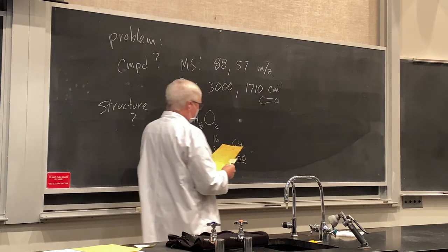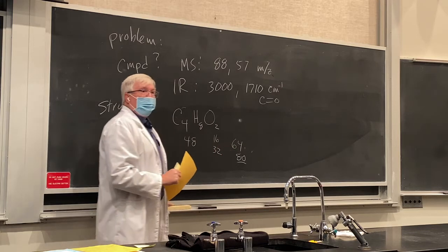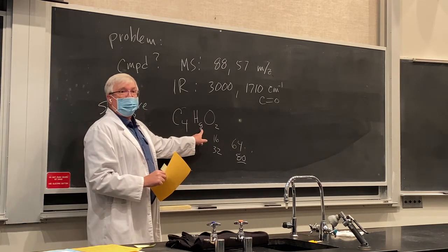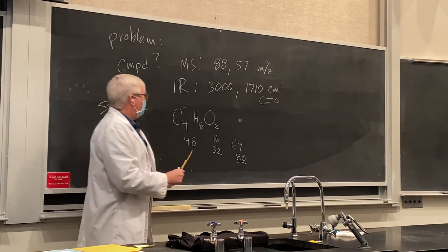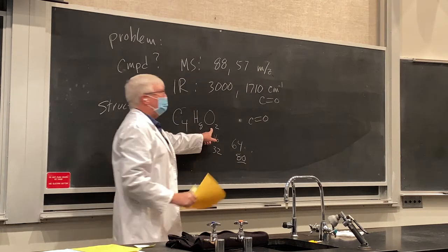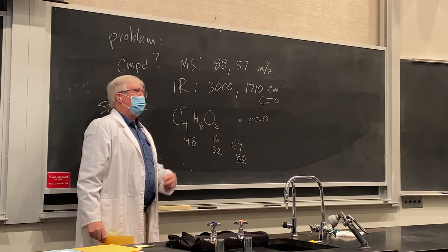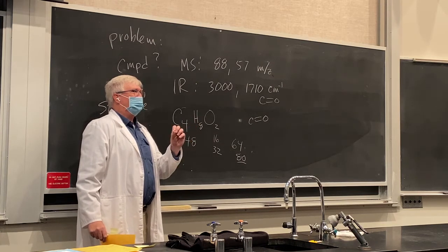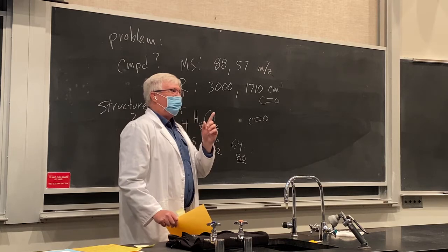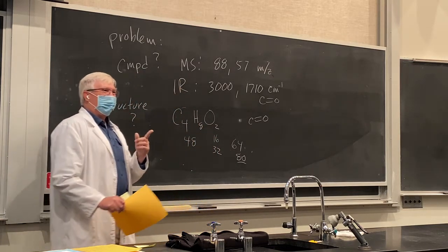Well, how many units of unsaturation do we have here? Well, that's our carbonyl, right? We have 1 unit. The max would be 10. So we've got 2 less hydrogens. So we got a carbonyl, okay? So let's stitch a carbonyl in there. Well, we've got 2 oxygens we need to have in our structure, okay? Can you think of a functional group that has 2 oxygens and a carbonyl? Yeah, what is it? Remember the functional group? Starts with an E. What is it? Okay, ester. Okay, very good.